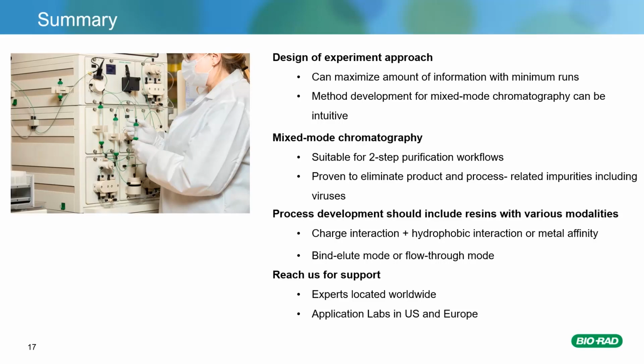Resins such as Nuvia A Prime and ceramic hydroxyapatite are proven to eliminate the product and process-related impurities, including viruses. It is important to screen mixed-mode resins for every project. By testing orthogonal resins, the optimal solution can be established in a shorter time. Also, if they can operate in different modes like these two examples, it can give you more flexibility in the designing of a purification process.